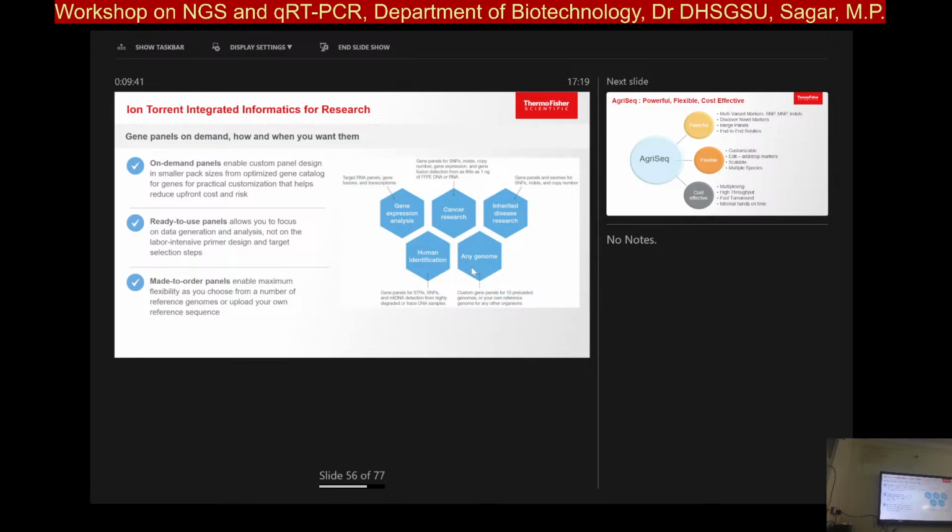So it may be hearing loss, right? It may be your cardiovascular diseases. We have these panels coming in over there. They have been studied for a long time. With that, you can have something called on demand. So disease-oriented genes are taken up, studied genes, and clustered all together so that people can come and make their own panel out of it for tomorrow's studies.